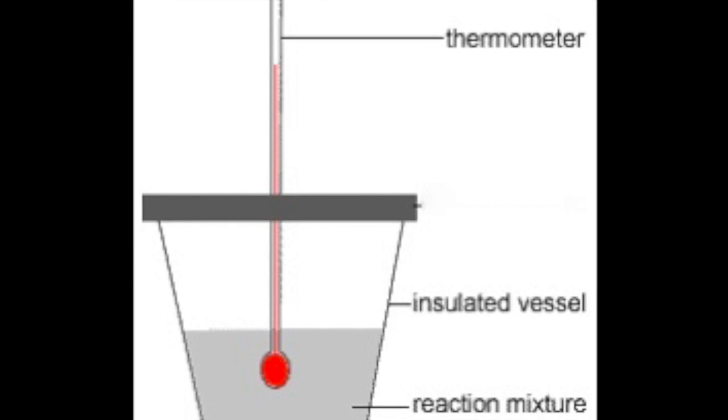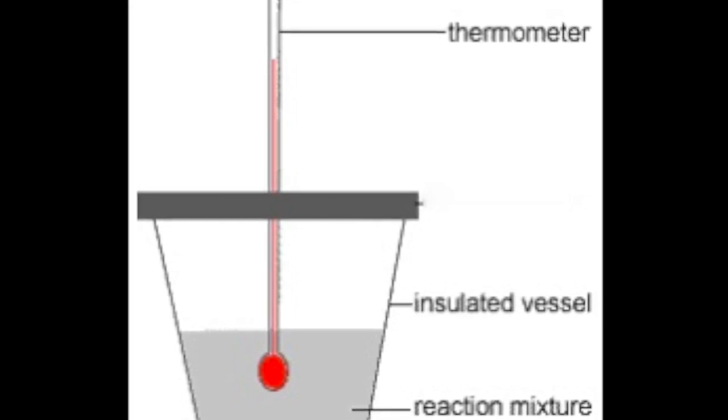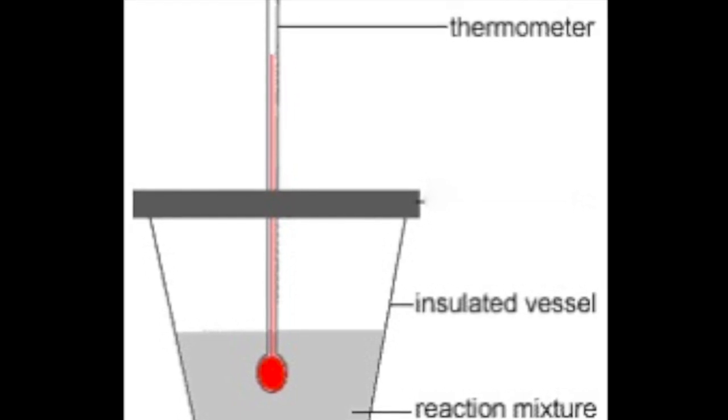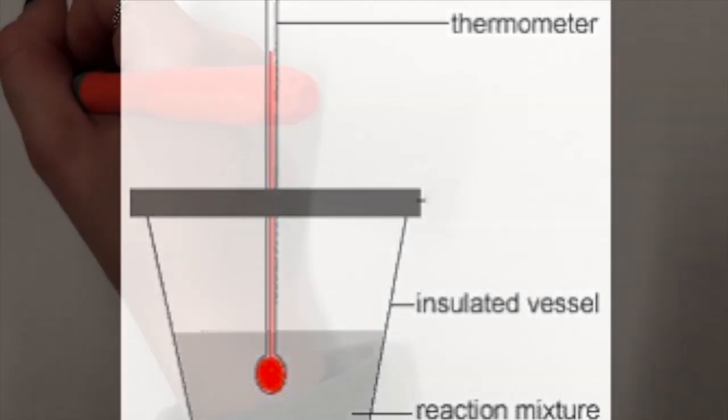We neutralized 20 milliliters of 1 molar hydrochloric acid and likewise for the sodium hydroxide. For consistency, a balance is used to measure equal masses of the sodium hydroxide and hydrochloric acid, as in this lab we considered 1 gram to be equivalent to 1 milliliter.